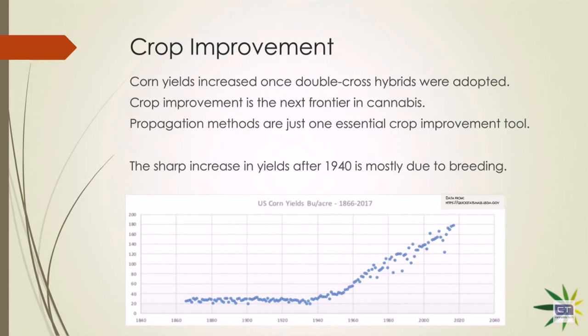And maybe you can help me on this one as well. Do you have a rough idea of the production cost per clone that can be achieved with micropropagation? I can tell you, to cut a clone, if you look at your cost from a labor standpoint and all of the inputs from your medium, the 14 days of power, all that, you're in about $2.30, give or take, call it 30 or 40 cents.